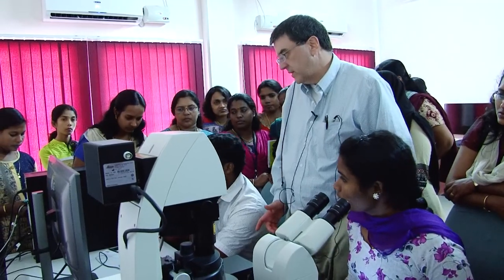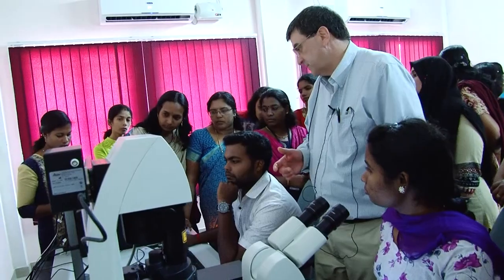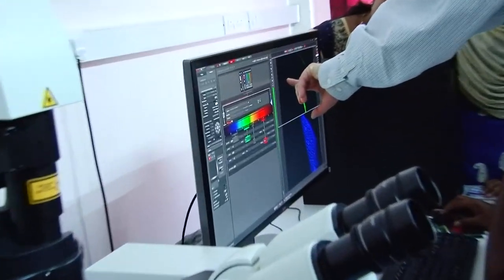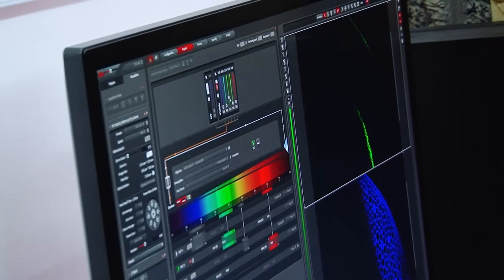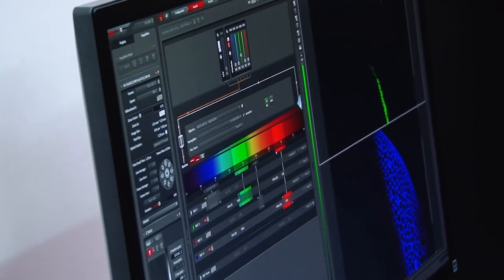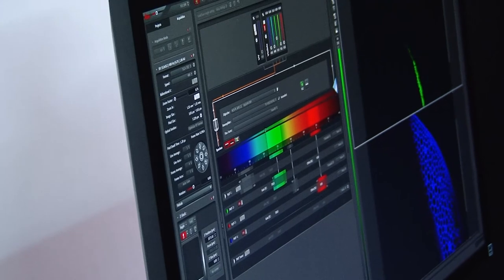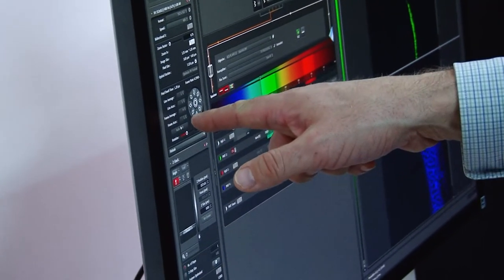Okay, so what we're gonna do here, she found something different. And again, look at the idea of the confocal here. It's catching this plane here a lot better, but not so much here, okay? Because remember, it's a thinner section. Okay, so what I want you to do is focus up and down. Okay, and we'll turn the averaging back off. We'll turn it off this time.